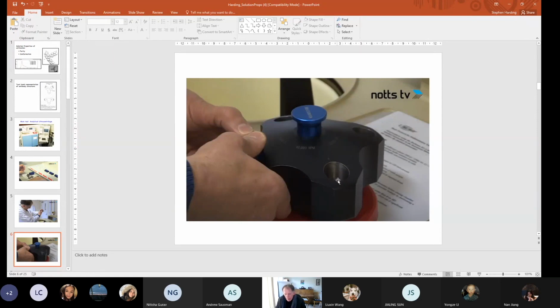But you always have in one of the positions what's called a counterpoise cell, which helps you to calibrate what you see on the computer in terms of actual distances from the center of the rotation, which is the center of this spindle locator here.